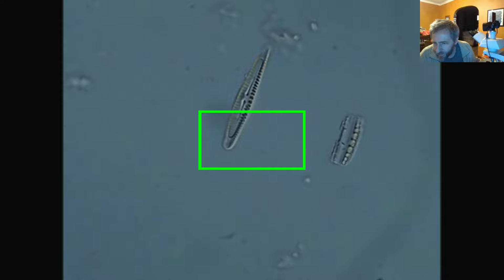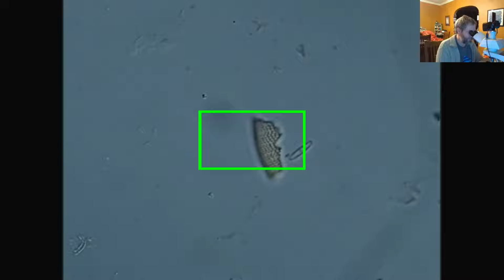What are the interesting dendrites? I don't know what the dendrites were. Probably just some organic junk. Like a diatom hermit crab. That's a good way of thinking of it, Runelore. They're using the dead bodies of other diatoms. The diatom frustules are often used by other organisms for lots of things, so that you often find diatoms getting incorporated into the valves of tintinnids and things like that.